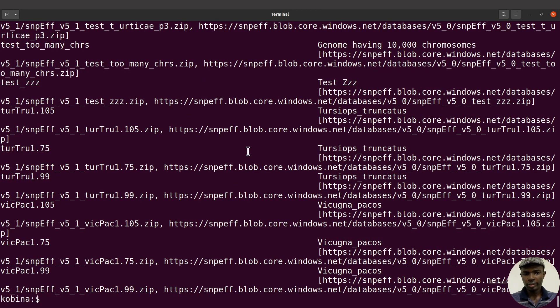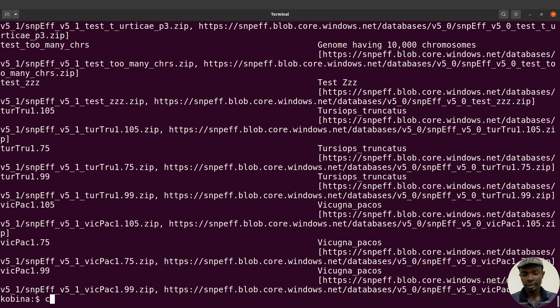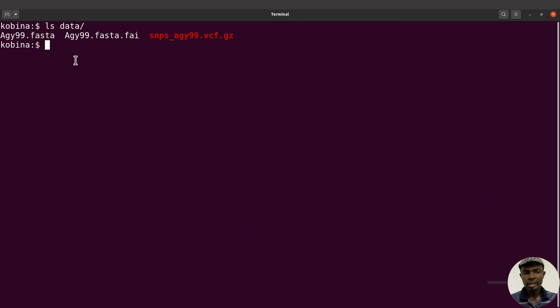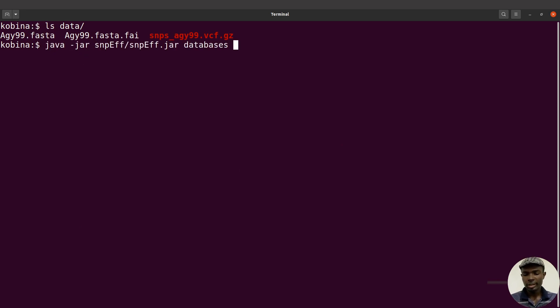Once we do that, we have the databases listed — there are lots of them. What we are interested in is our reference sequence, that's AGY99. So we'll recall the same command, this time add a pipe and say grep with quotes, and look for AGY99 like this. Let's execute this command.